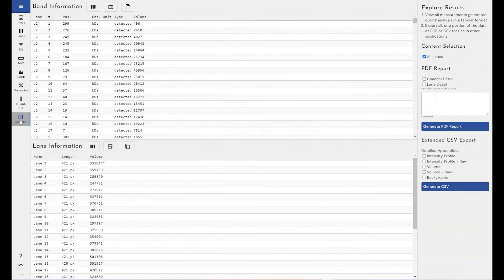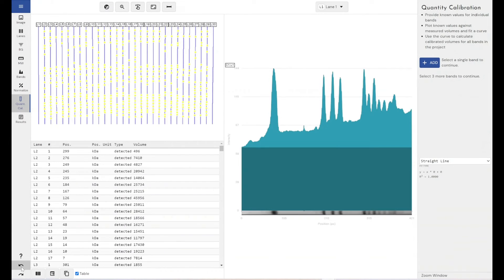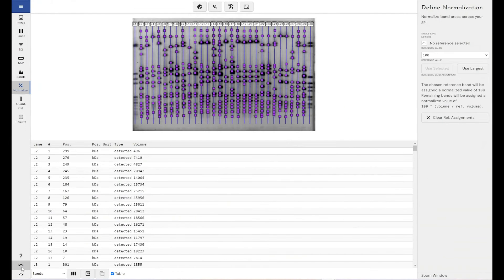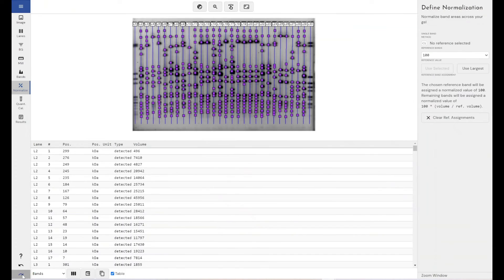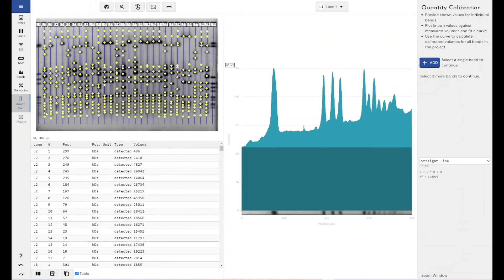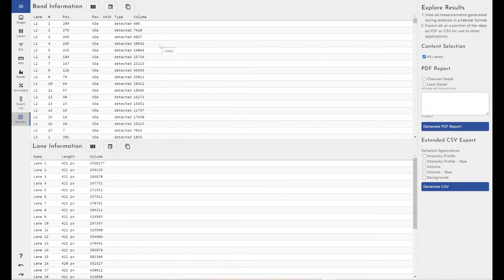So everything I've done there as part of my workflow has automatically been saved in a list as part of Phoretix 1D. And that's what allows you to have the undo function. It basically just goes to the last option it remembers you doing. So I get to the end of my results of my first gel and I know I've got 100, 200 more to do that look exactly like this.